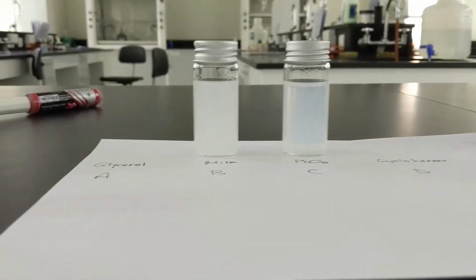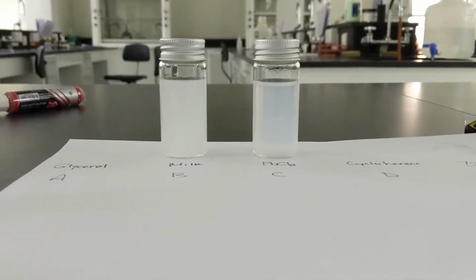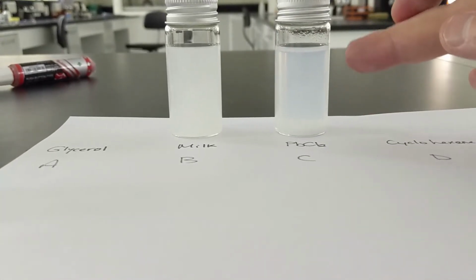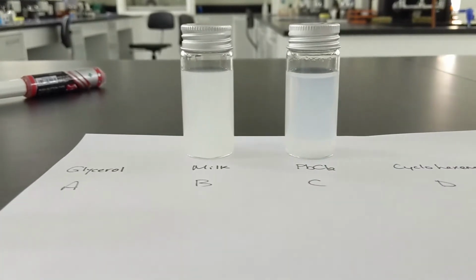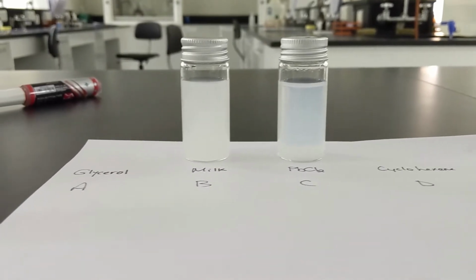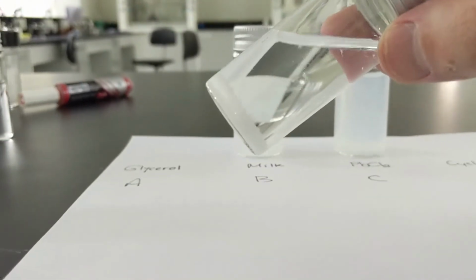Okay? So something is happening here which can help us really define the difference between a colloid and a suspension. Even as I'm talking, you can start to see this mixture is sedimenting, or there's sedimentation happening at the bottom. I have another vial of lead-2 chloride that I let sit for maybe 15 minutes, and you can see that right here. Look at what happens when I let this sit.